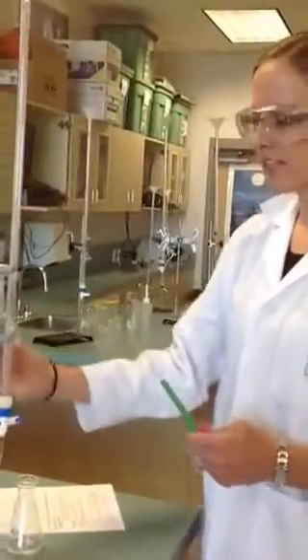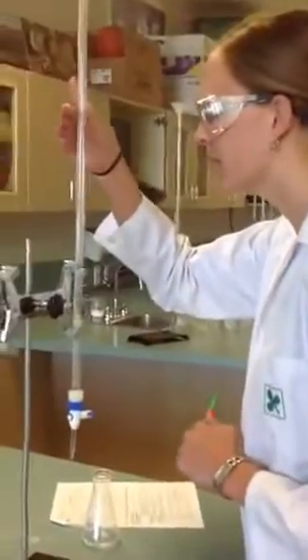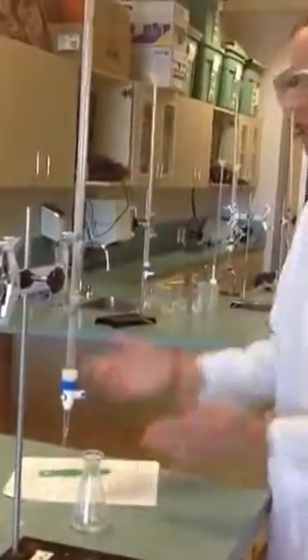Once you've got your indicator and your acid, you're going to walk to your station. First, I'm going to make sure there's enough base in here. You're going to be in the 20 to 30 mL range of base for any of our acids to work. I can see I have enough base, so I'm going to go ahead and start. I'm going to take my initial reading of my base, which is 14.5. This one is super important to record because you can't go backwards.